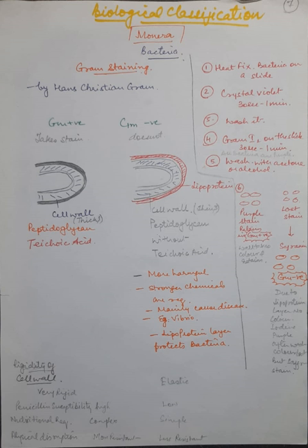So this helps in clear distinction between gram positive and gram negative bacteria. See, gram negative bacteria take the safranin stain, and whatever color was present here was taken up only temporarily by the lipoprotein layer, and it gets washed off easily by acetone or alcohol. When it is further treated with safranin, it takes that red color. If the cell wall has only peptidoglycan, then only this crystal violet will be present in it, and it will give the purple color.